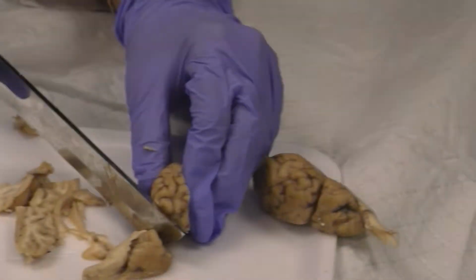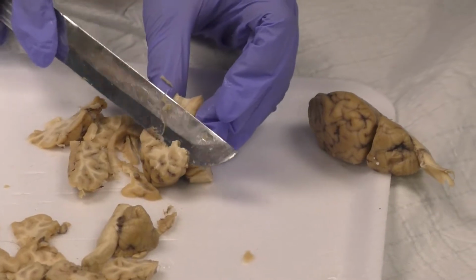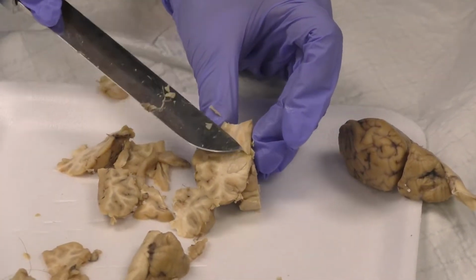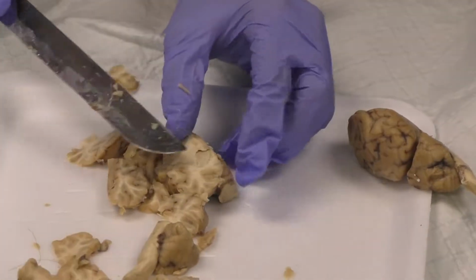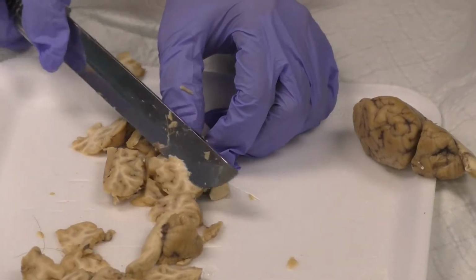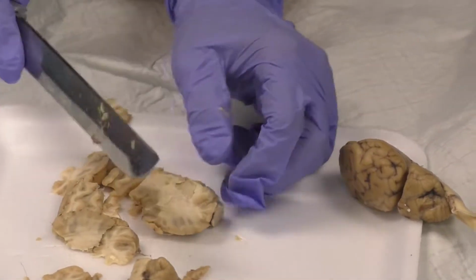Sorry, I'm going to cut off the cerebellum. You're in my way. Oh, see? It's getting bigger, top of the C. And note that the ventricle is surrounding the hippocampus. So we go down.